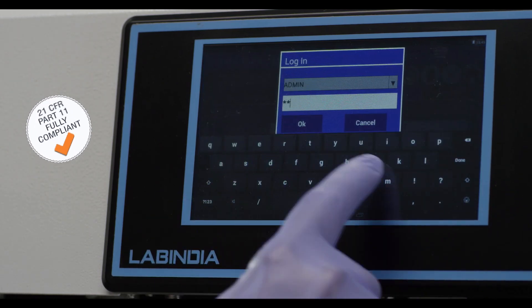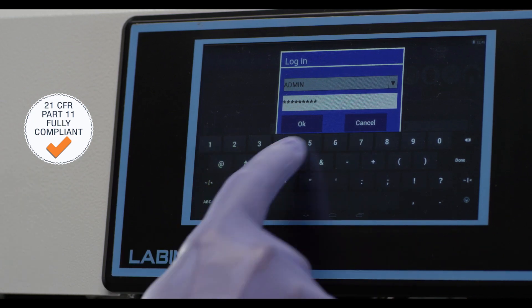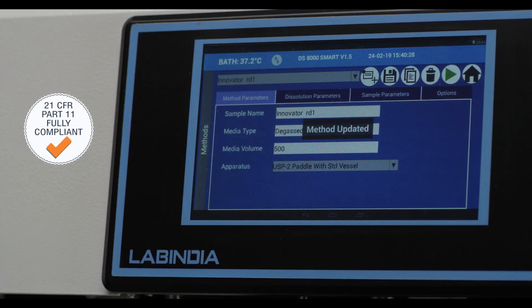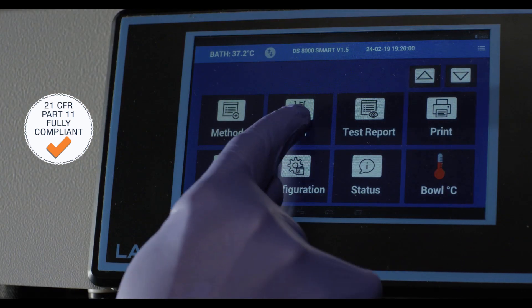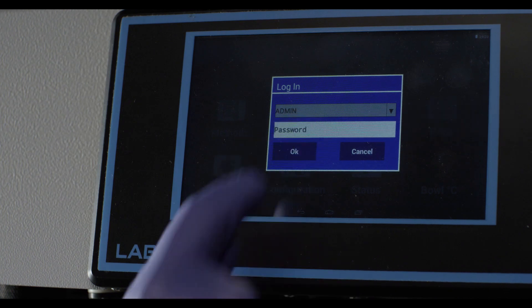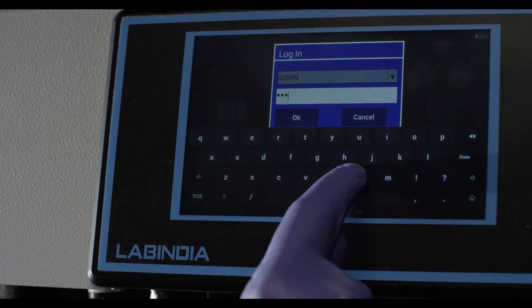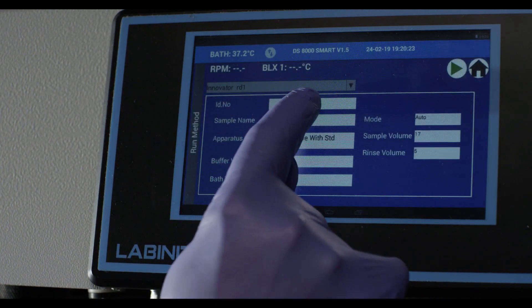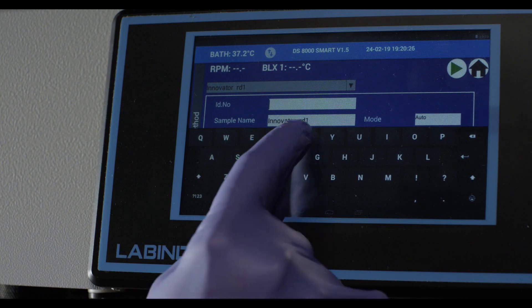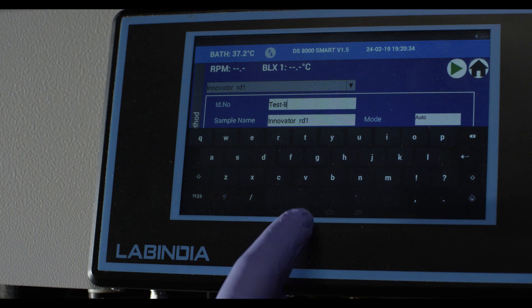The software is 21 CFR Part 11 compliant and user interactive for ease of operation. Once you set the method and the appropriate apparatus and media, you can start the run. The Diso Smart has memory storage of 16 gigabytes, expandable up to 32 gigabytes.